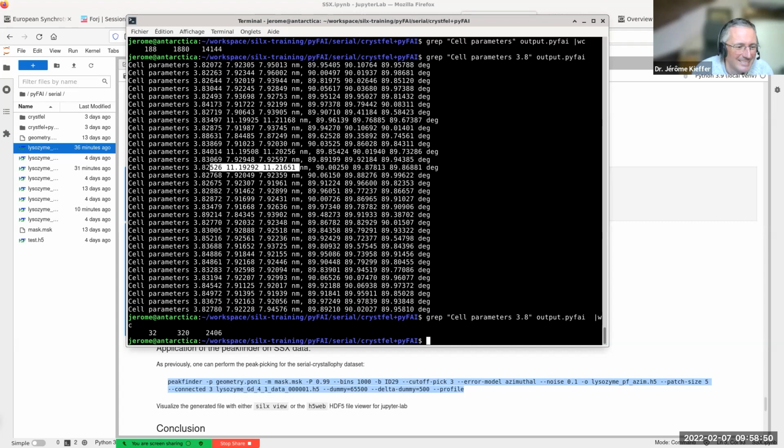I don't blame you that you didn't do something wrong, but if you want to continue, like optimization of parameters, for example for compression, then you have to do proper analysis, also looking at CC star and R split. It's all actually explained in the CrystFEL tutorial. But again, maybe it's not even your task. It should be somebody from ID29, maybe Nicolas. I'm not sure who is from where, because users would need support. Exactly. You can't give users just, here is your data, try to do something. With XDS, it works. With CrystFEL, unfortunately, not yet.